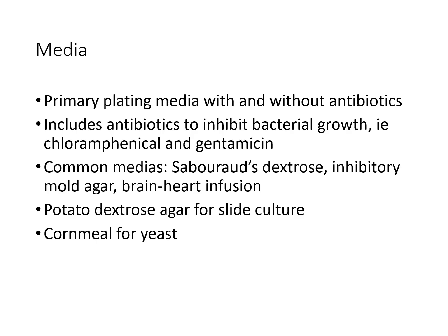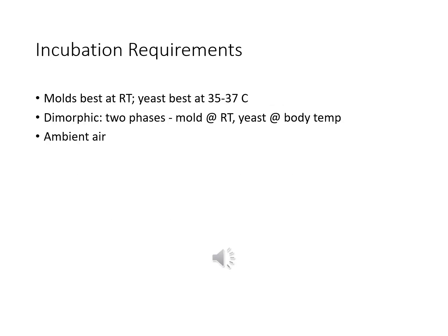For specialized purposes, potato dextrose agar, or PDA, is frequently used for slide cultures to study fungal morphology and sporulation, while cornmeal agar is preferred for yeast identification because it encourages the development of characteristic structures in Candida species. So using the appropriate media, with or without antibiotics, is crucial to ensure successful fungal isolation and accurate identification.